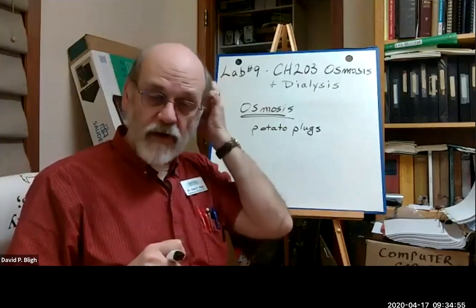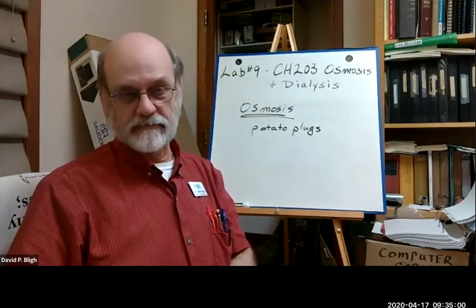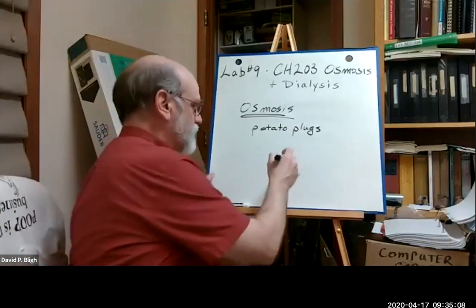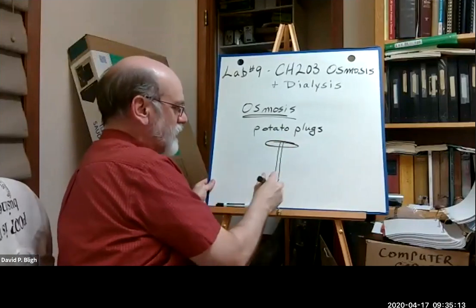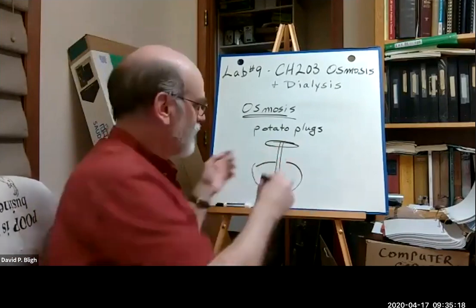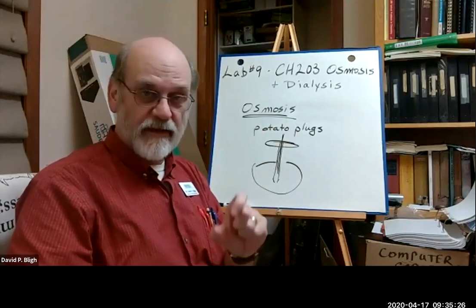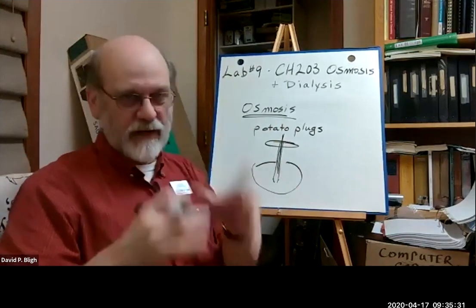So we're going to use one of those and just bore into an Irish potato, probably a russet. It's got a sharp end, so we bore into our potato, take a plug out, and then we stick a long thin rod down there and push the plug out, right? And then we cut off a piece of about 40 millimeters or thereabouts.